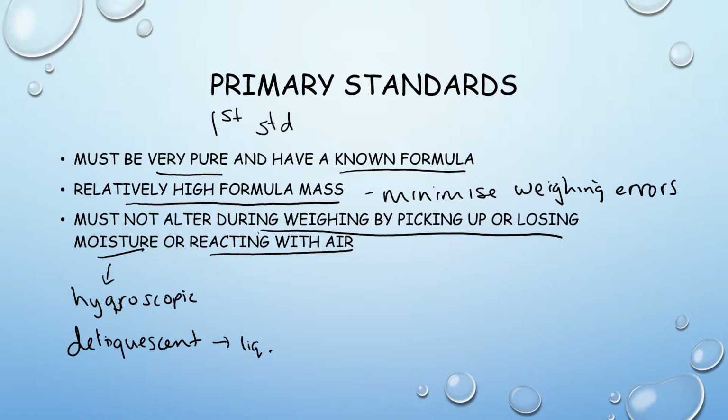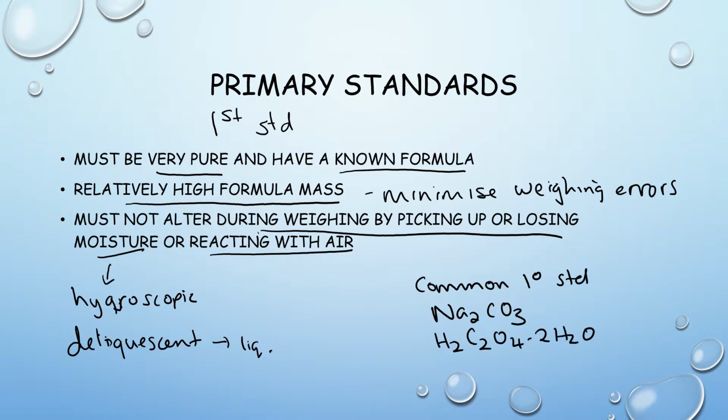Now, for acid-base titration, the common primary standards are sodium carbonate, oxalic acid, and sodium tetraborate decahydrate. In our titrations, we're going to be using sodium carbonate.